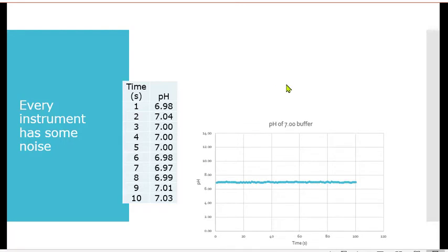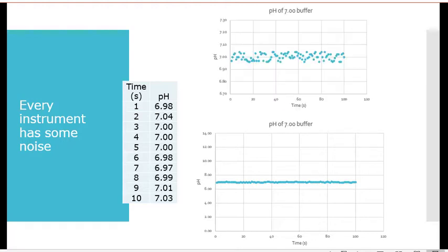In fact, it has a little bit of plus or minus in the hundredth. But every instrument has a little bit of noise. If I blew up just that first 100 seconds and really showed you around the pH 7, you'd see that there's electronic noise. A lot of times that arises from different things. Part of it has to do with using an alternating current circuit to run instruments.